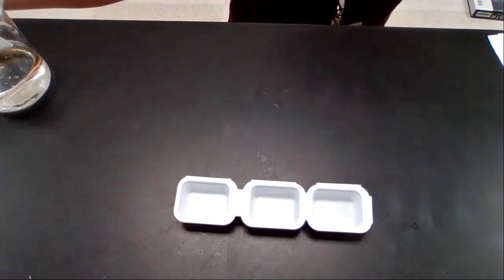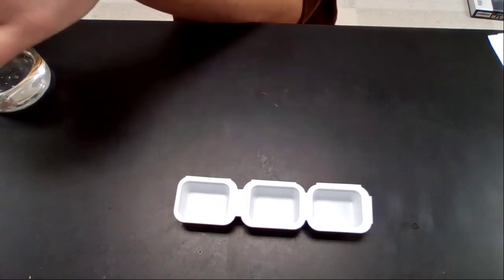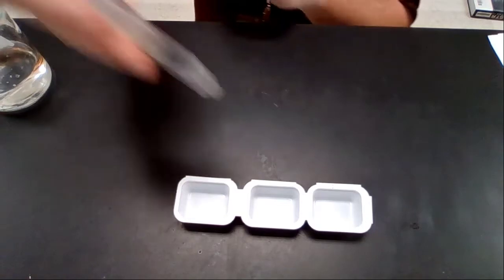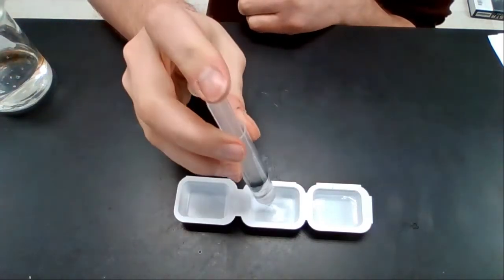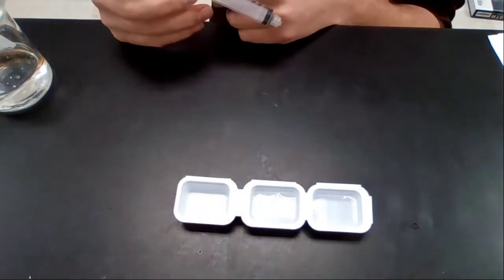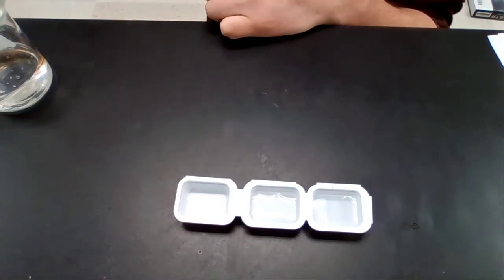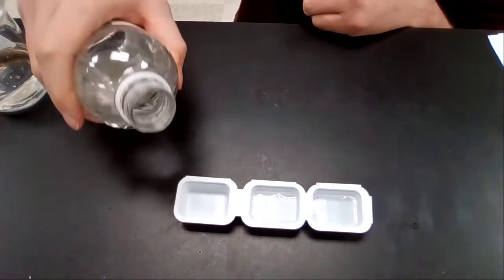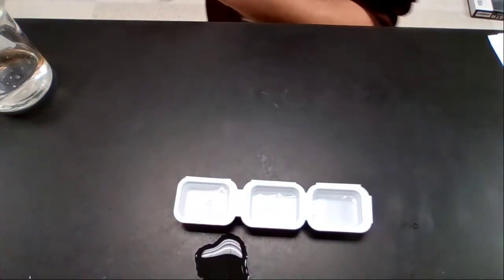So the first step says to add 5 milliliters of water to wells 1 and 2. So let's do that. Well 1. And well 2. Awesome. Fill well 3 about half full with white vinegar from the bottle at the shared material station. Fortunately, I'm at the shared material station. Oh, all right. That's half full. We'll go with that.